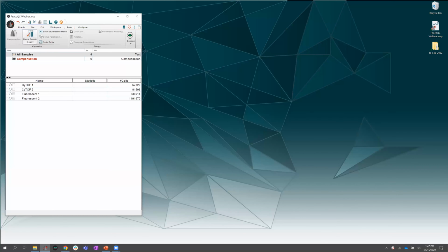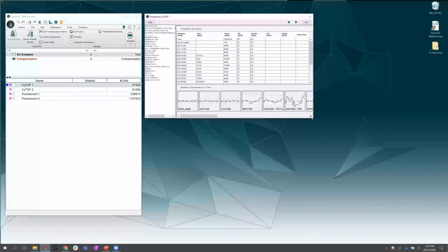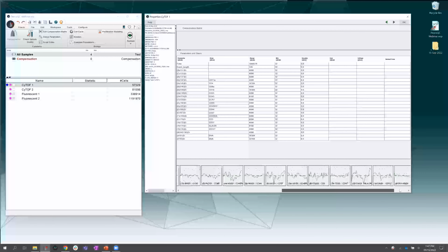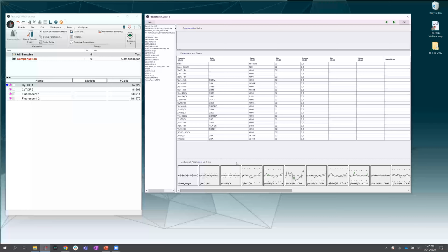Okay, so if I wanted to do that, I can navigate to the Tools tab, hit the Check Sample Quality button, and here I can see that a lot of them have kind of this magenta color. So, according to the signal stability in the Properties window, which I can launch by double-clicking that badge, it's picking up some periods and some of these parameters that are maybe approaching those standard deviation boundaries or deviating from the mean in a significant way from the rest of the run. Okay, and so based on that number of flaws or deviations, that's where it's getting this badge score from.